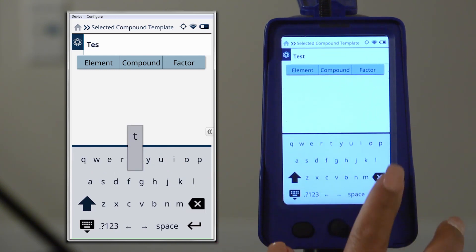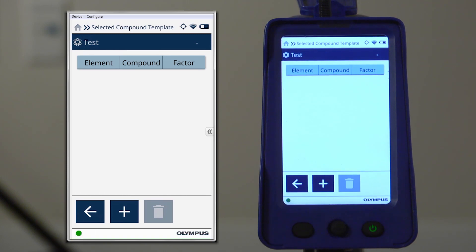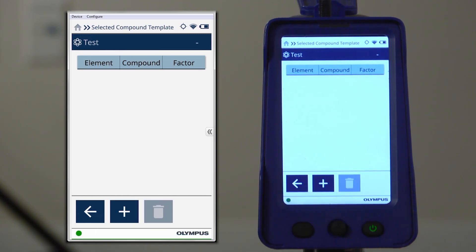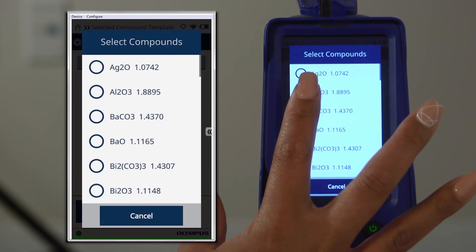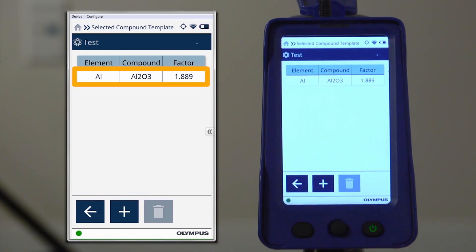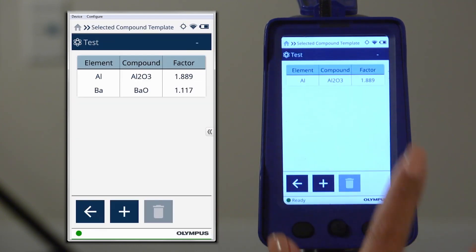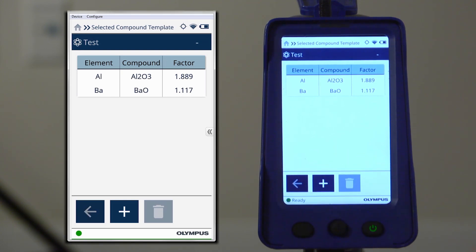To add a compound to your template, press the plus icon in the bottom tray and select the compound from the list that appears. The compound formula will appear along with the factor used for calculating the compound from the element. Select as many compounds as needed.